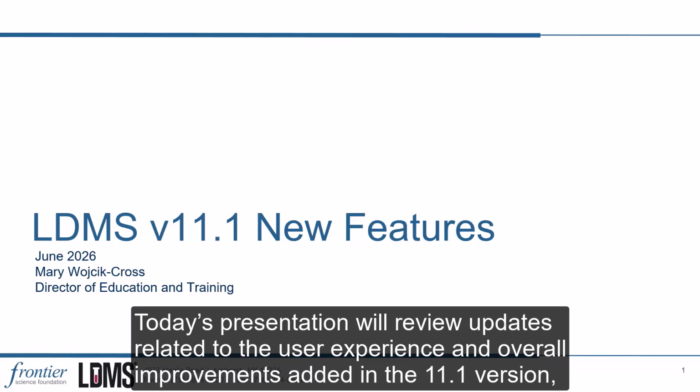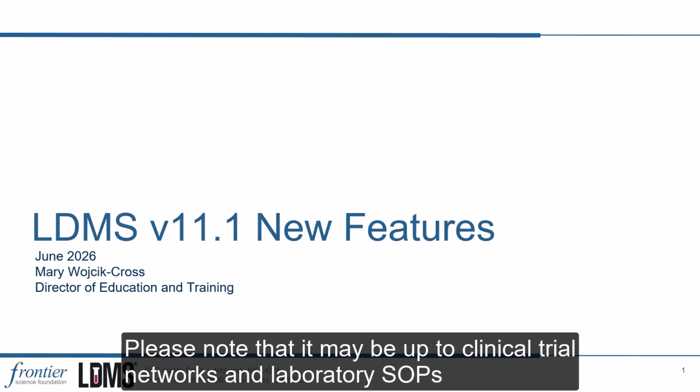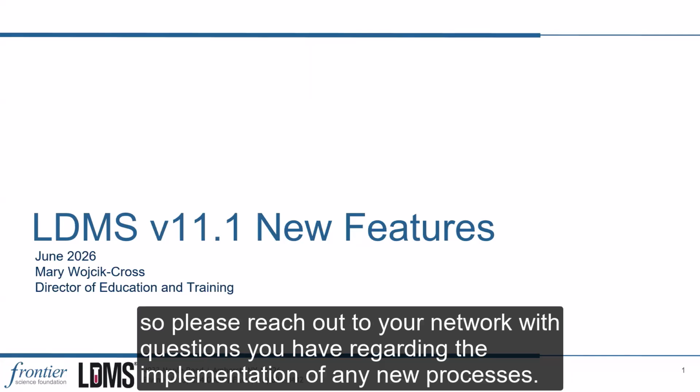Today's presentation will review updates related to the user experience and overall improvements added in the 11.1 version, as well as module-specific updates and a handful of project-specific updates. Please note that it may be up to clinical trial networks and laboratory SOPs to determine how you should use some of these features, so please reach out to your network with questions you have regarding the implementation of any new processes.